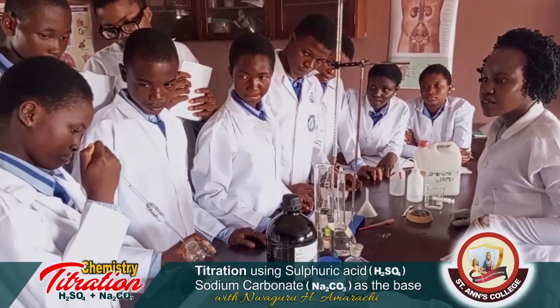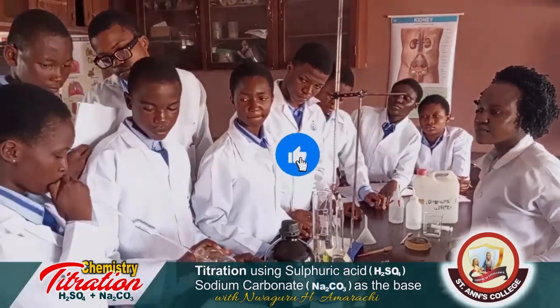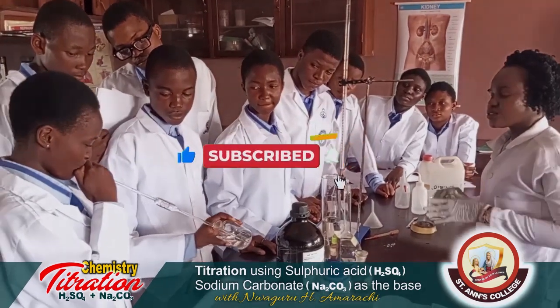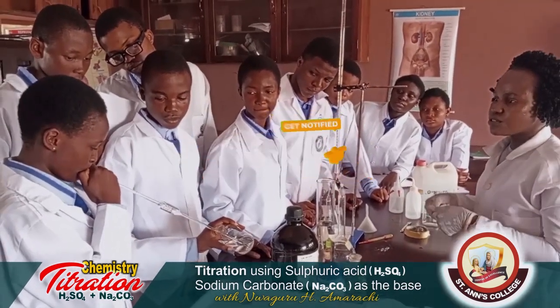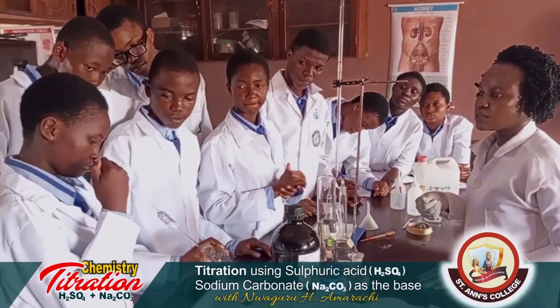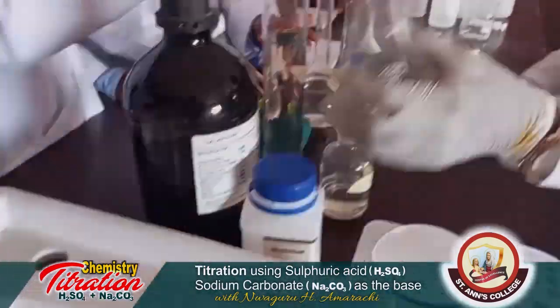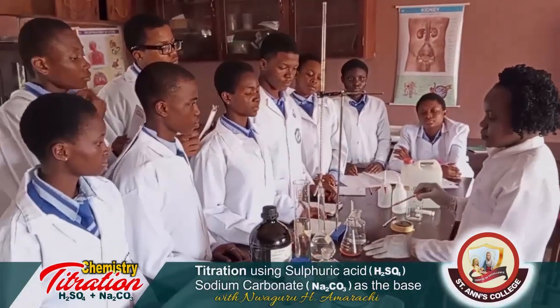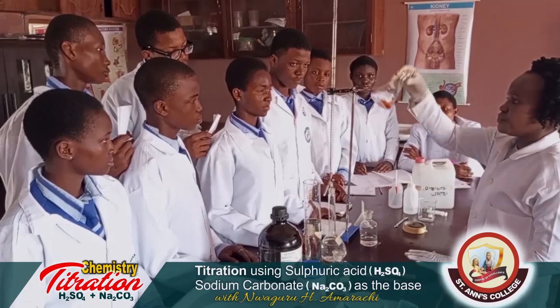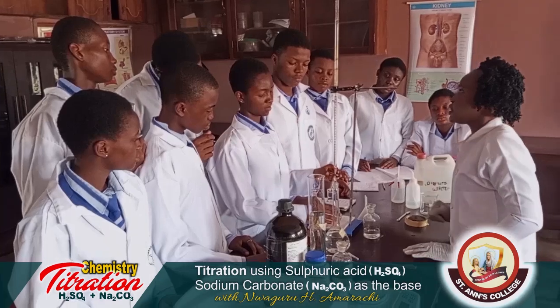Easy, easy. Just take it easy, take it one at a time, and don't remove your hand immediately. Good. Then our indicator, 2 drops. You can see the color change, right? Then we titrate.